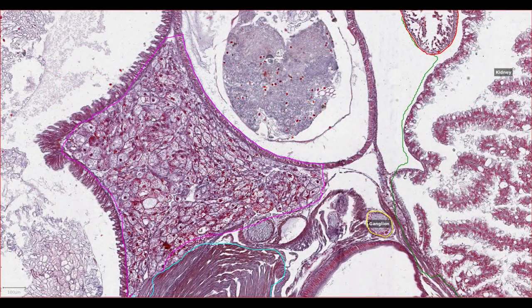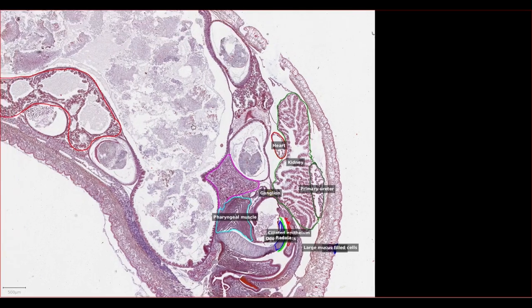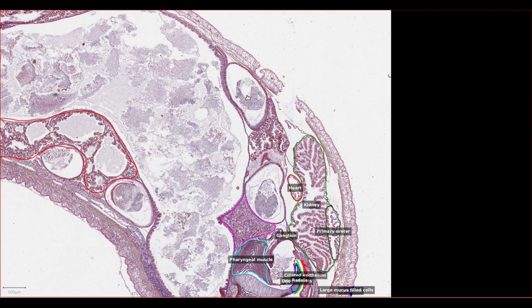Moving aborally, or away from the mouth in the specimen, we can see some large dilated chambers, such as this one here, another one here, here, some more down here. These dilated chambers are the stomach and intestines of the snail.